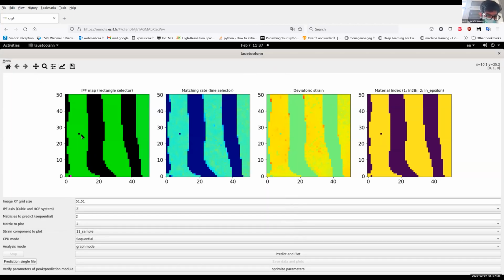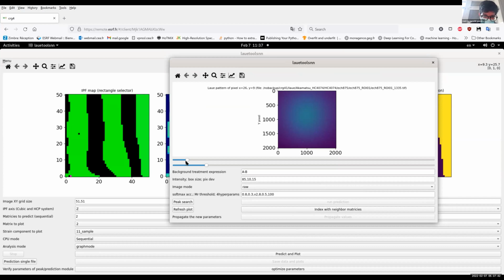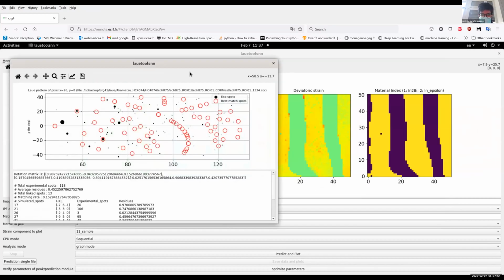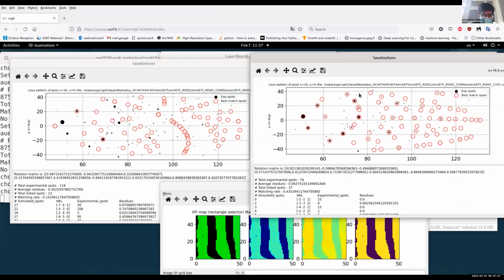But the thing is, if you see the nearest grain, which is similar and not so different, I can maybe show directly the indexed Laue pattern, which is actually the same one, the non-indexed one and the indexed one. Apparently the indexed one is less noisy, whereas it's the same pattern. So I can use the nearest neighbor, and it should also work. Sometimes it can also fail, but during post-processing you can run a loop again to index with the nearest ones. More or less, it works.